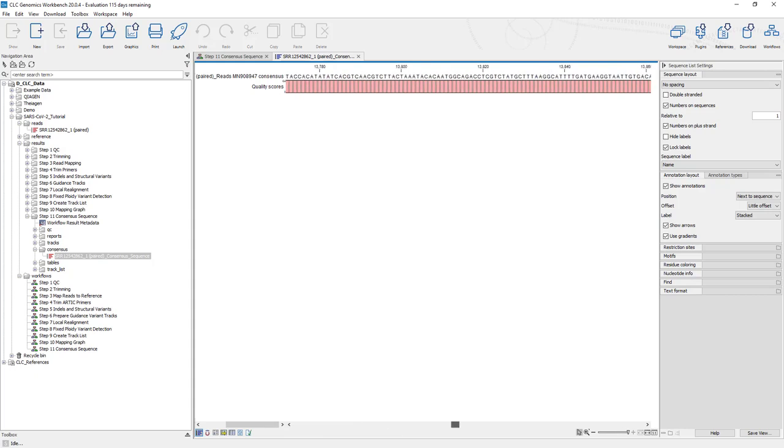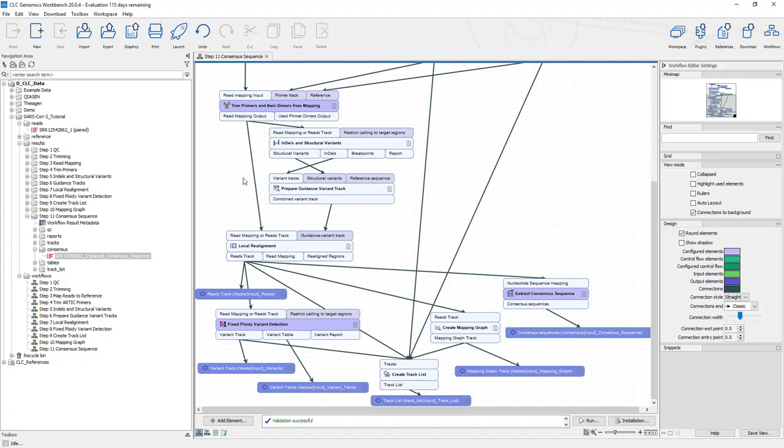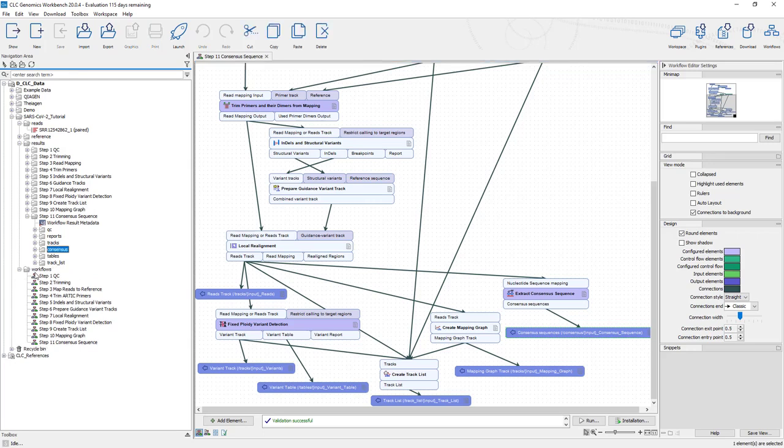And there's going to be ways that we'll rename this in other workflows and look at pass-fail, but that's how simple it is to extract out a consensus sequence in this workflow. So I can close that and make sure that workflow is saved. So we have one more step to finish on the single specimen analysis, and that's the QC for read mapping. So be back in a few.